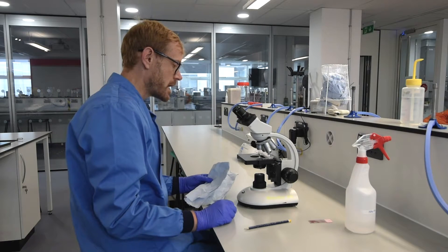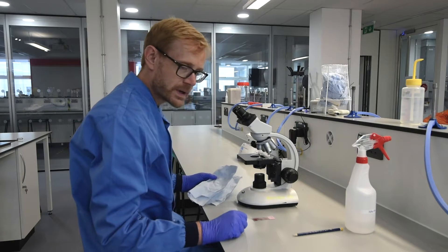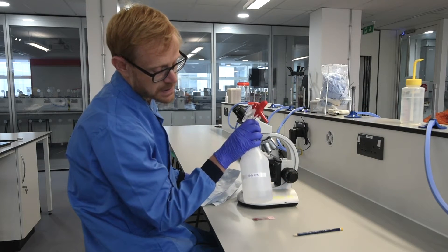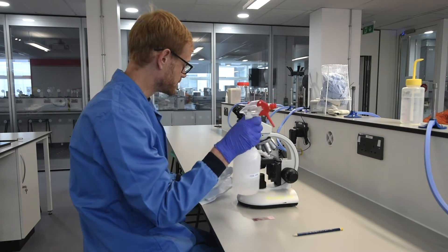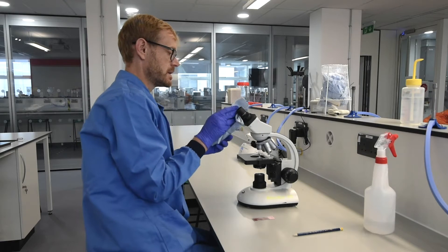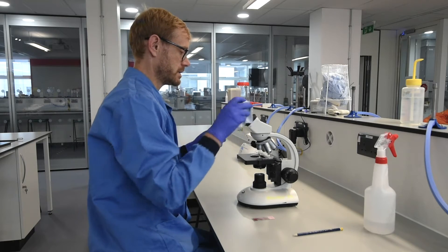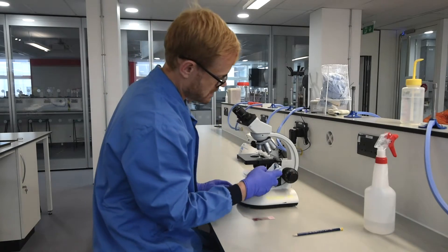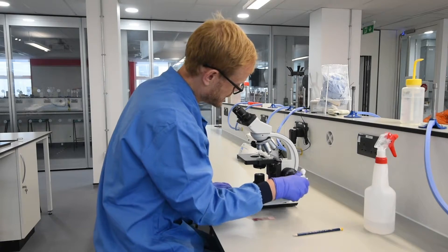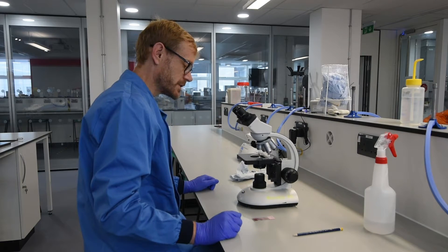We've stained our slide now and we've got a light microscope, which can be found under the end of the benches. We're now going to look at our chromosome preparation. First of all, we need to make certain we've wiped down the microscope using 70% industrial methylated spirits. We spray that onto some blue towel and wipe down the areas that someone else may have breathed on recently — mostly around the eyepieces, the XY focus, and the fine focus knob.